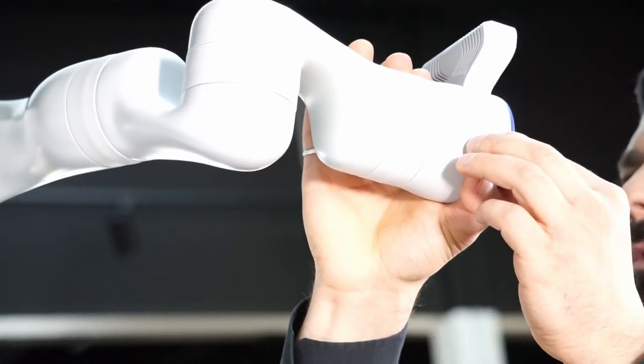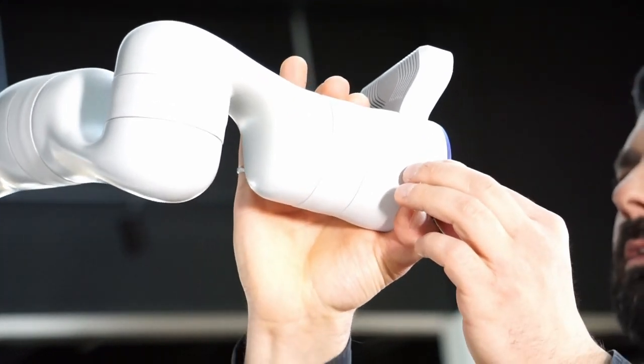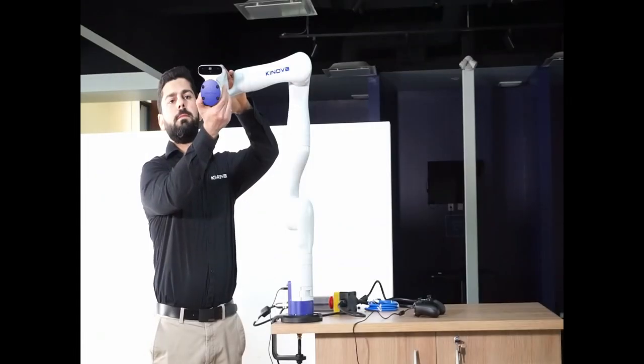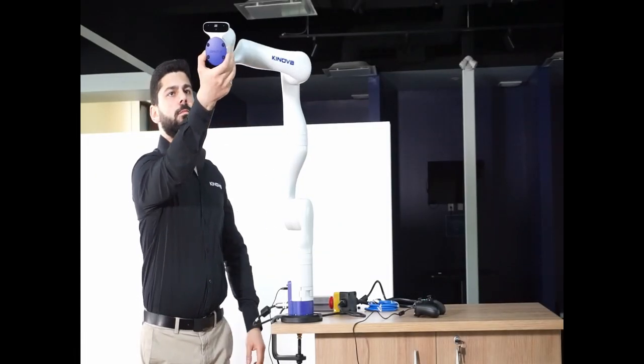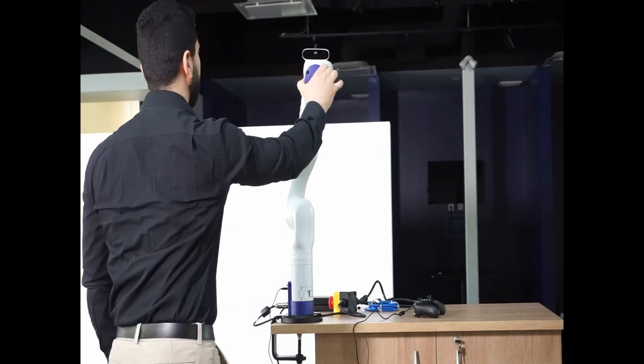When you press and hold the left hand side button, you will control your robot in joint admittance by applying force by hand to move each joint.